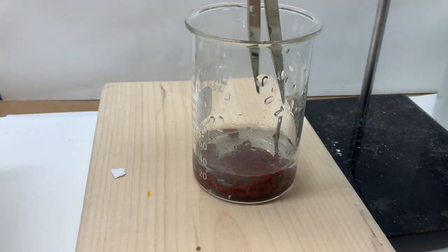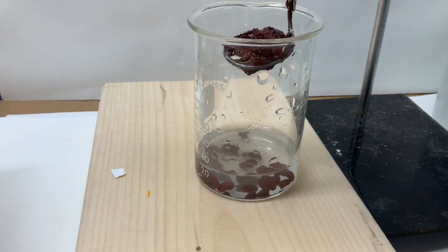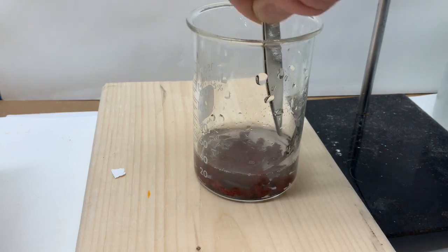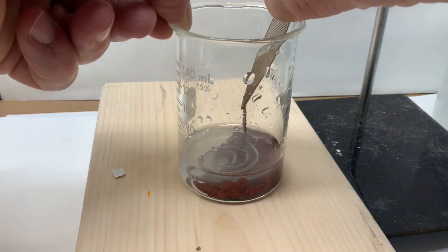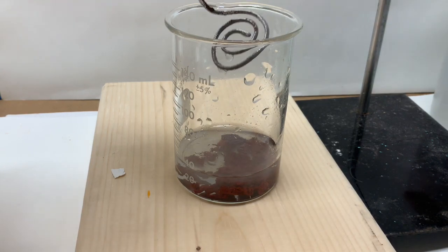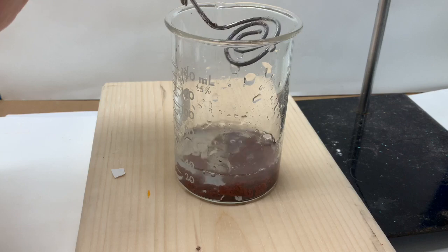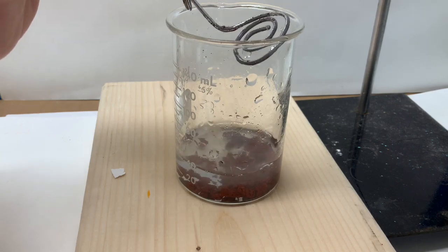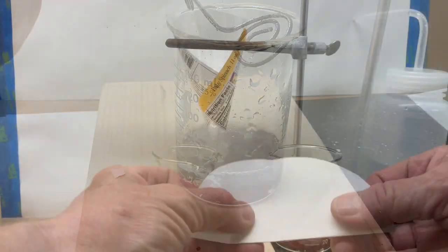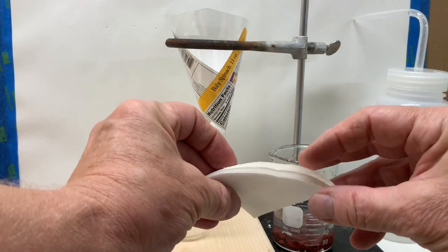What's happening to the color of the solution? And what is that giving us evidence of? Finally, the excess aluminum wire will be removed, shaking off the copper metal that has formed and rinsing off the wire to try to get as much of the copper off the wire and into the solution. Eventually, the solution will be discarded and only the copper will be saved, dried, and eventually weighed.